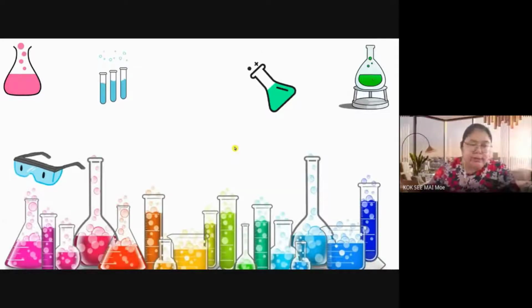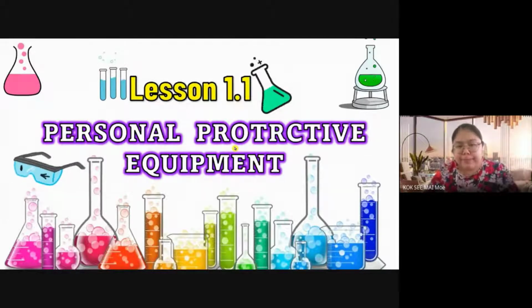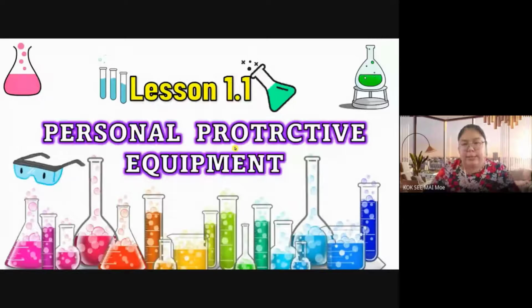So today the first lesson should be chapter 1.1. Okay, personal protective equipment. So we learn about the equipment you need in the lab, and also some of the safety in the lab when you do the experiment. So we go through the lesson.